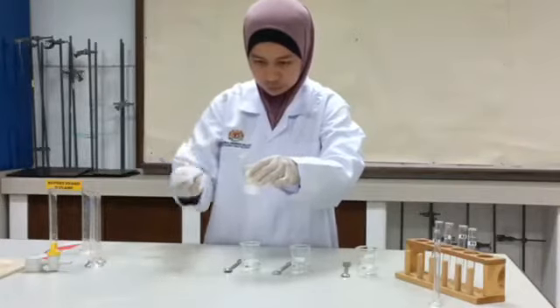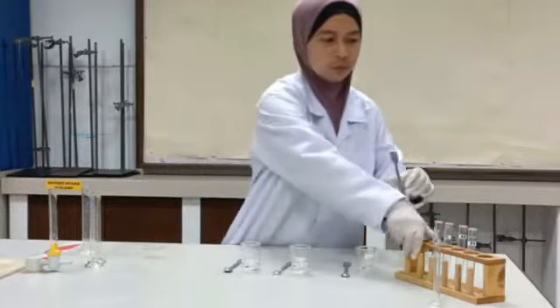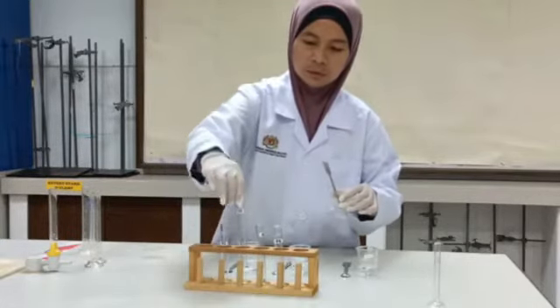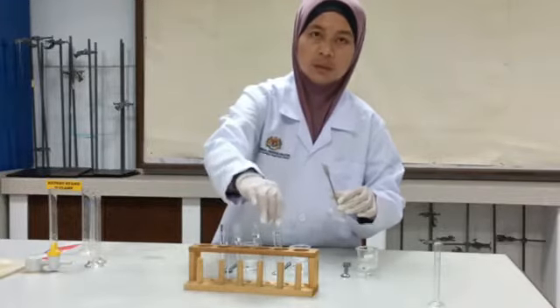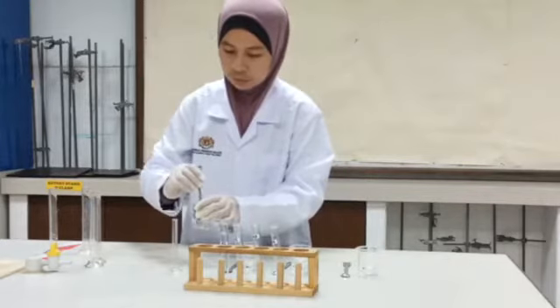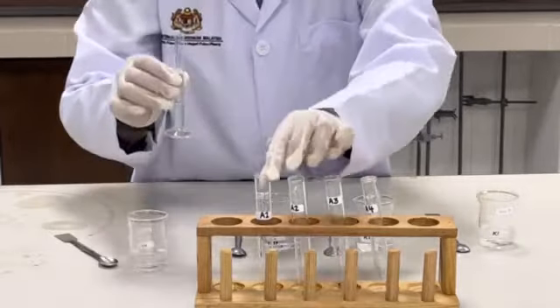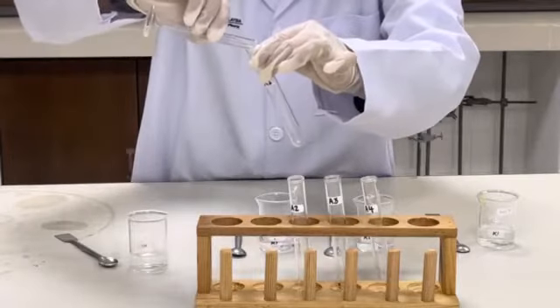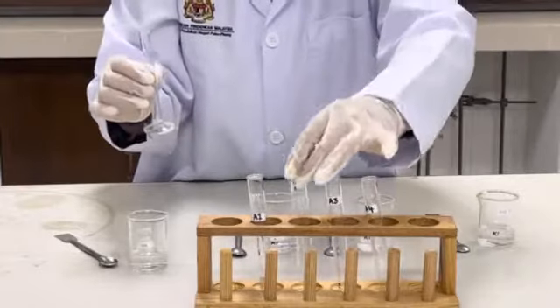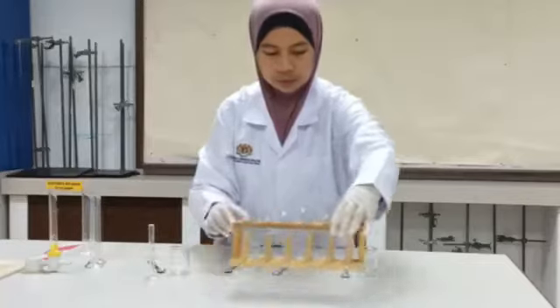Measure about 2 cm³ of salt A solution for each test tube: A1, A2, A3, and A4. We measure 2 cm³ and pour it into A1. Then we measure 2 cm³ into A2, A3, and A4, and we repeat with the other salts using the same method.